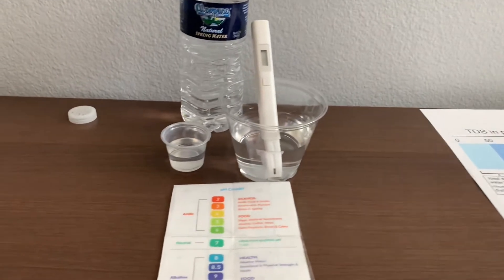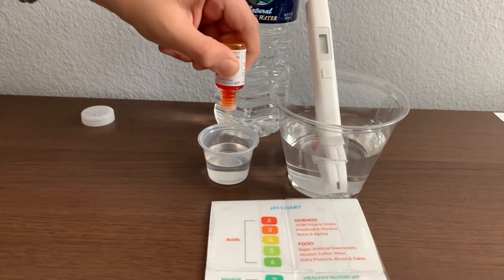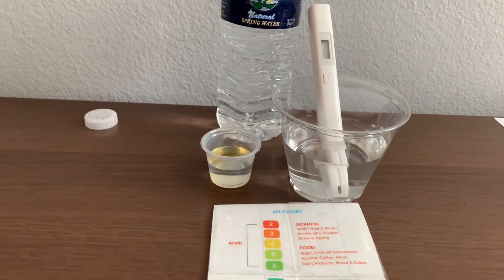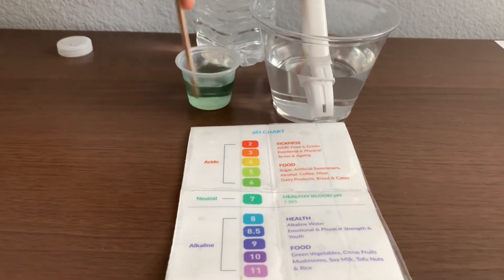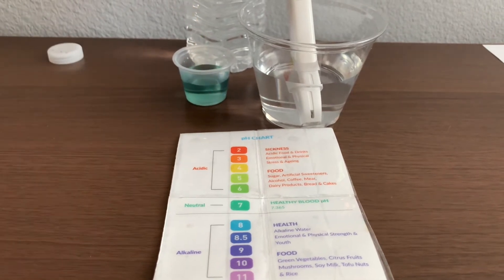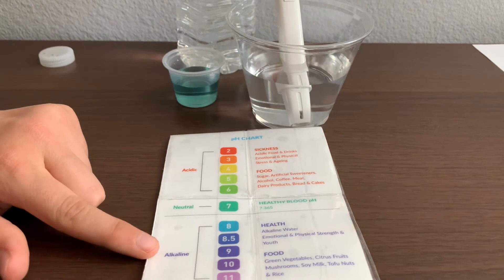Now let's test the pH level. Only do two drops. Let's test the pH level for a better result. I give this an 8.5. This is alkaline water.